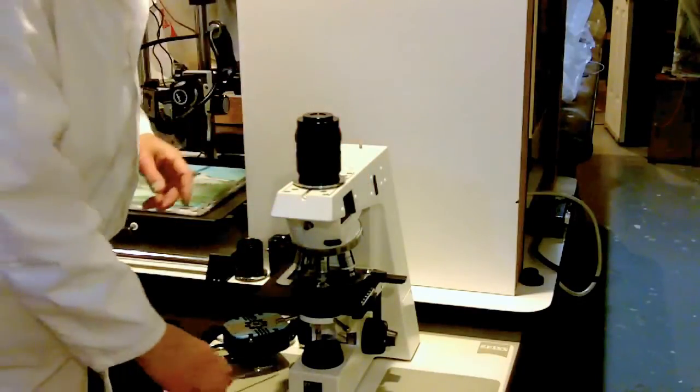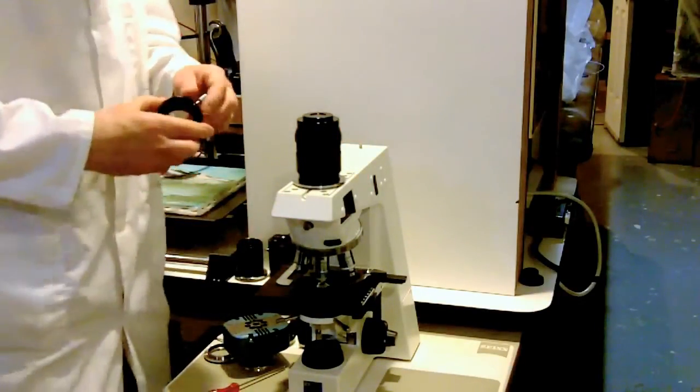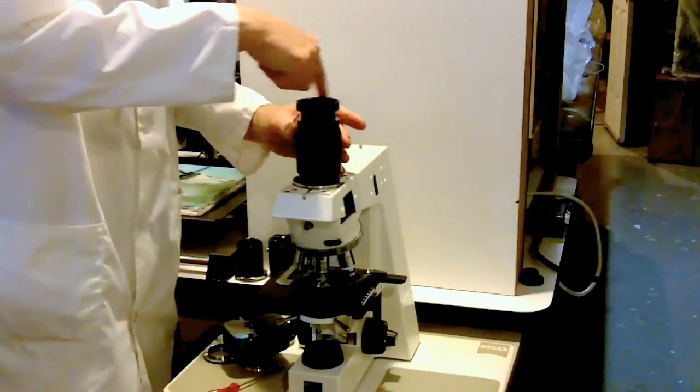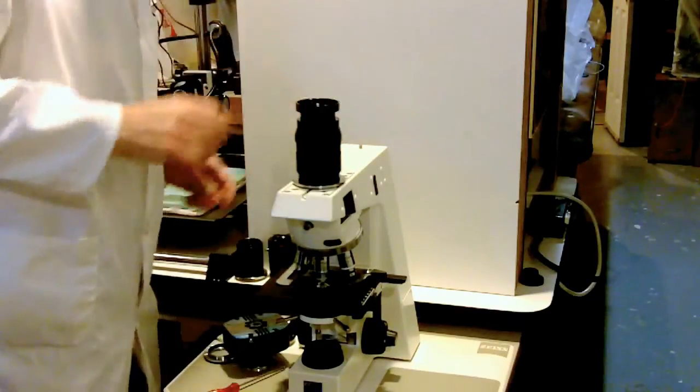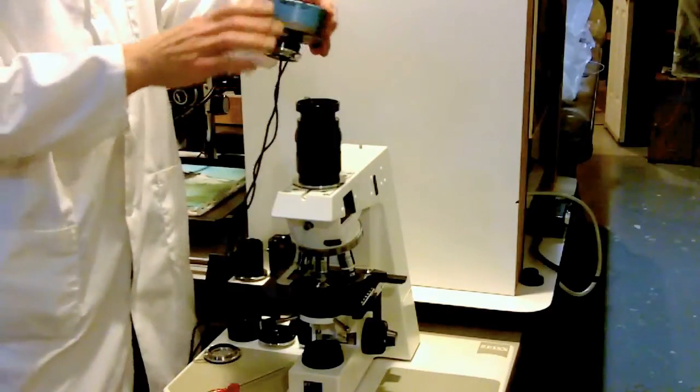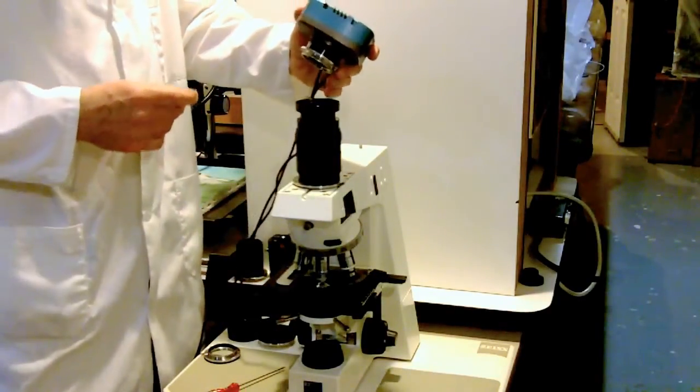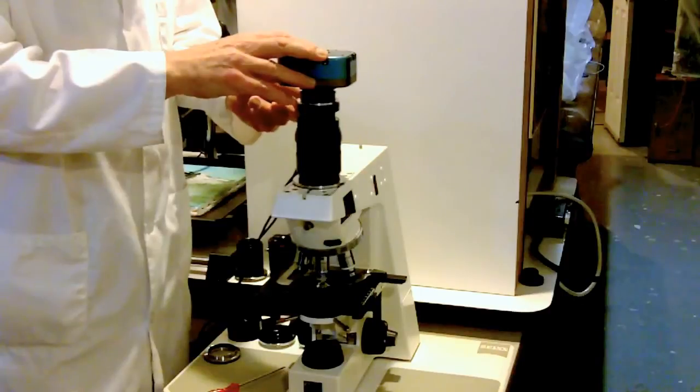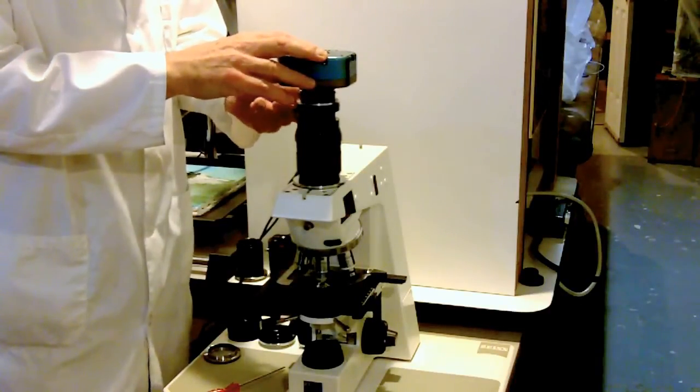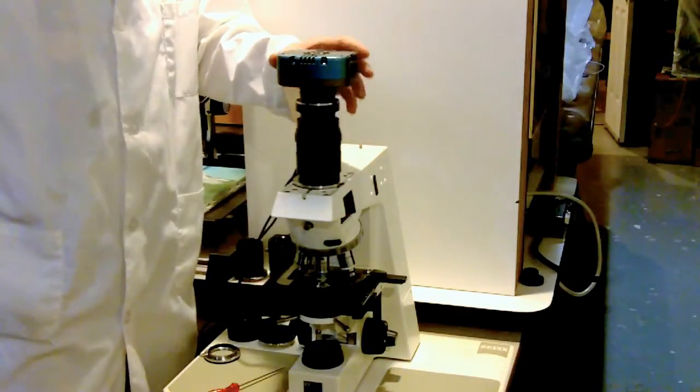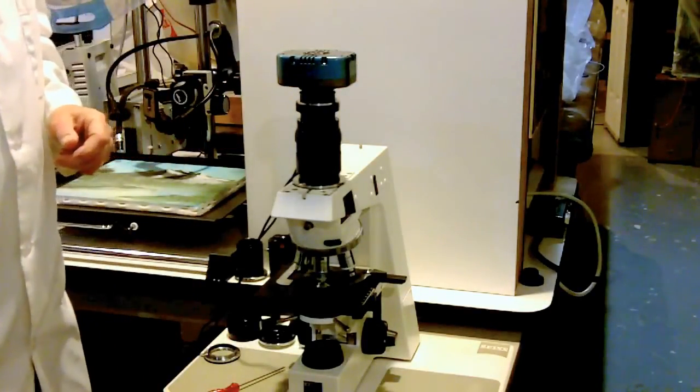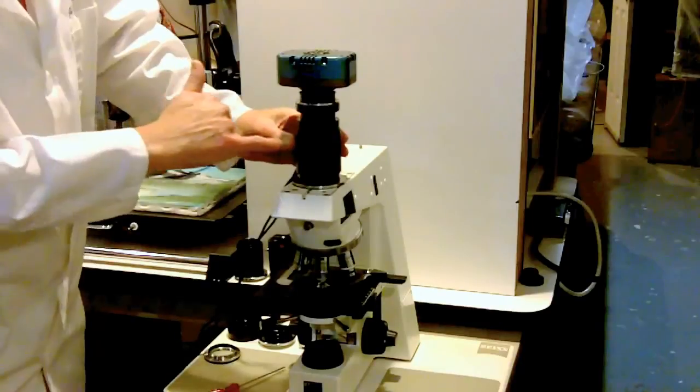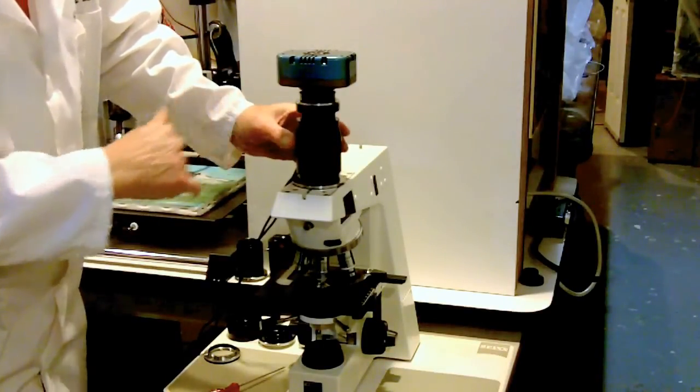We secure it with a screw. And one of the more popular cameras that's out there being used in microscopy is the so-called small format or C-mount camera. Here's a small format C-mount camera. You can get these with Peltier cooling or high-definition real-time 2K or 4K display. And here you can see we've got the small format C-mount camera mounted onto the microscope.